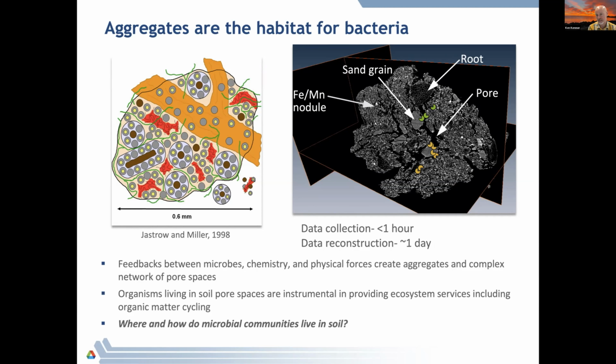And this is trying to connect the next big question that we're trying to address with soil aggregates, and that is the distribution of microorganisms within the soil. The problem is right now you have to draw a cartoon because the contrast, what you see with a microorganism compared to the soil pore or the water, is not very good for these very small objects, which are right at the spatial resolution you would get in a full field imaging. These organisms are about a micron in size, and again, that's about the size of a pixel. So it's still pretty hard to see something like this.